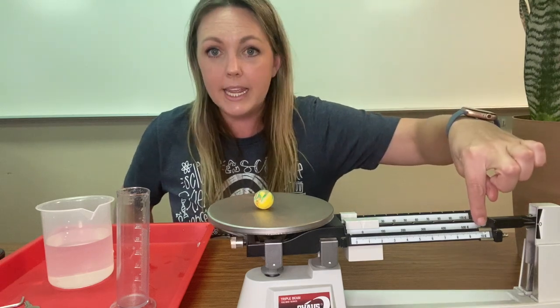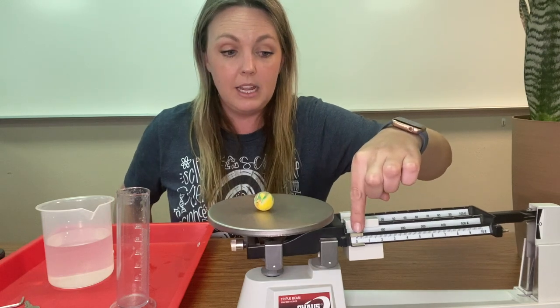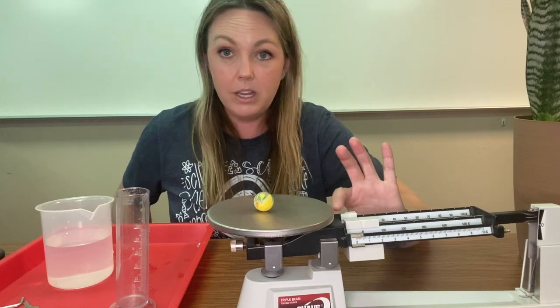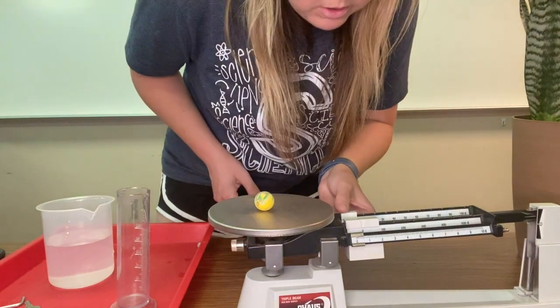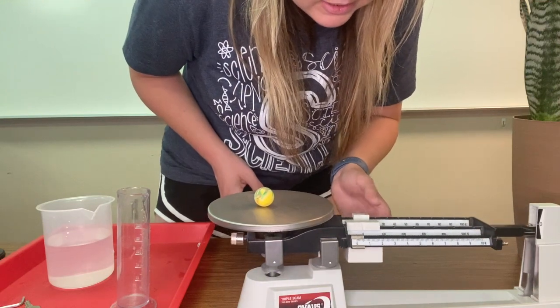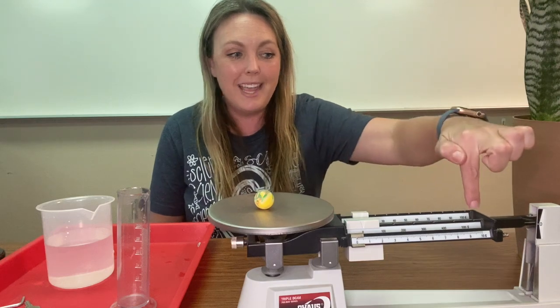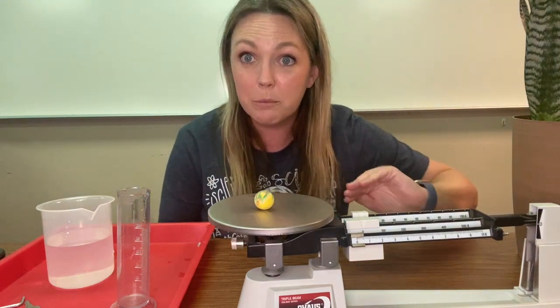This went all the way to 10, which means we have to bring it all the way back to the beginning. Then we're going to jump to the back bar because this one counts by 10s. We're going to start at 10 because we know that 10 was not enough mass to balance out our triple beam balance. It seems like we still have a little bit to go.